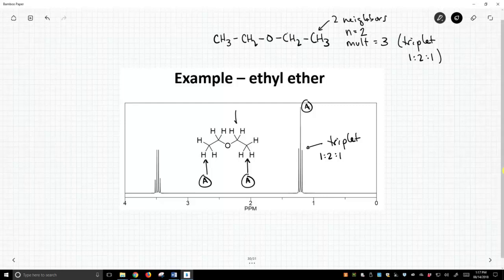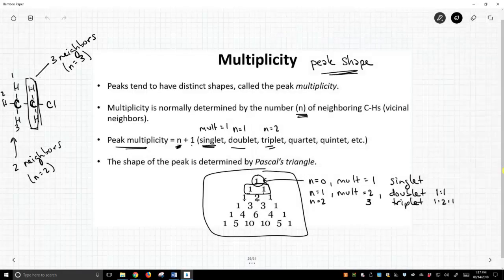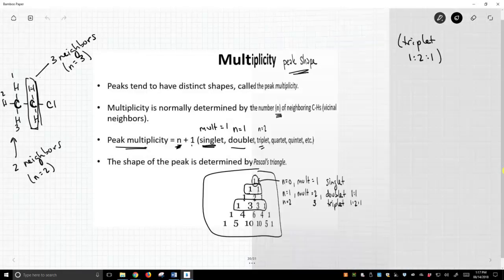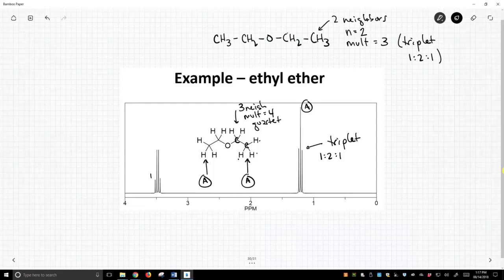How about these hydrogens? These hydrogens are on a carbon, and there's a next door carbon, and they're the three neighbors. So these have three neighbors, and so their multiplicity is going to equal four. And for four, we call those a quartet. And if we were to turn back the page for the quartet, they should have a one to three to three to one ratio. And this is about one to three to three to one intensity. This is our quartet.